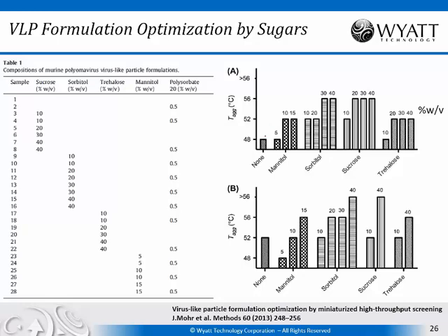And you can see that temperature varies depending on the type of excipient which was used, sorbitol, sucrose, trehalose, the amount of excipient used, so here's the percent weight per volume, and somewhere in there's also the information on with or without polysorbate. So again, it's very easy to carry this out. You perform all the different mixtures of excipients and polysorbate separately, load them into the plate, load the plate in the plate reader, and within a short amount of time you have all this information back in terms of assessing the thermal stability of each of these different formulations.